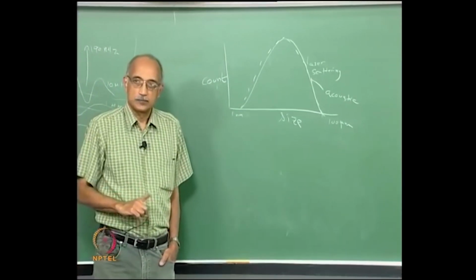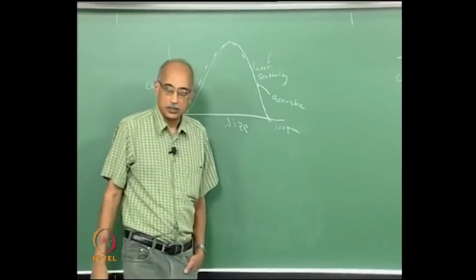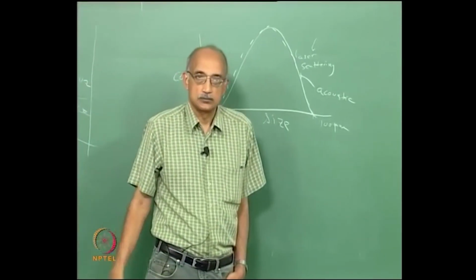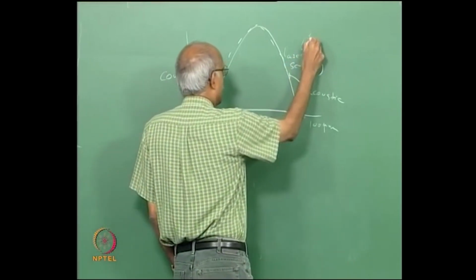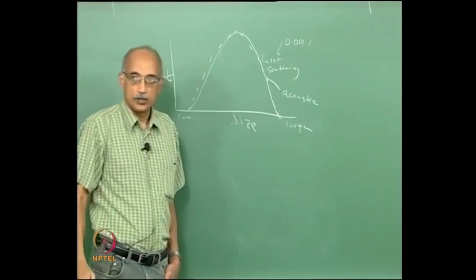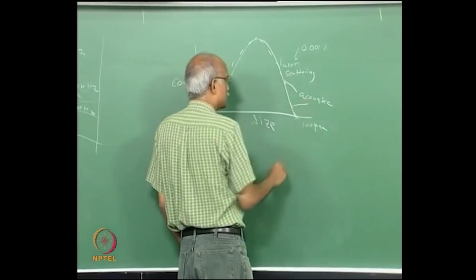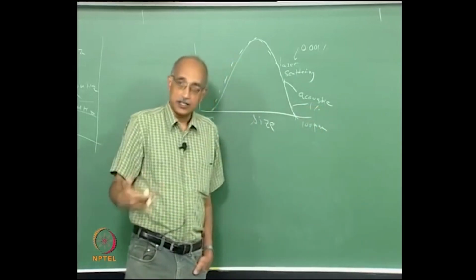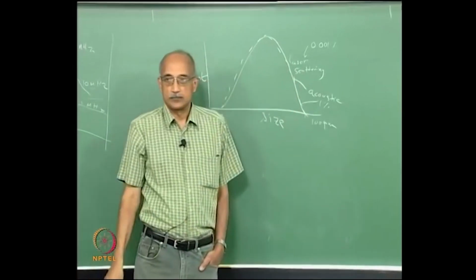But what is the difference? The difference is with laser scattering you would have probably measured at a dilution of 1 to 1000 roughly. So the volume percent of particles in this may have been, let us say, 0.001% in order to get good data, but the sample that is used for the acoustic technique, the concentration can be as much as 1%. In fact, it has to be as much as 1% in order for the data to match.